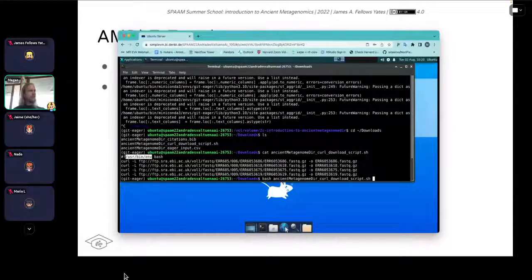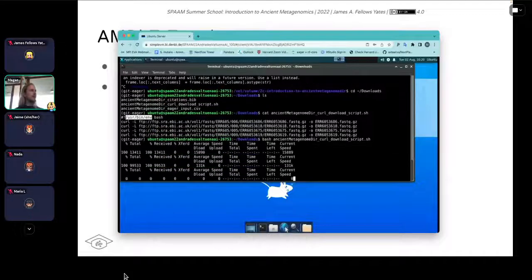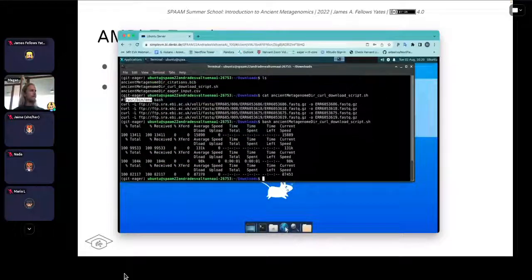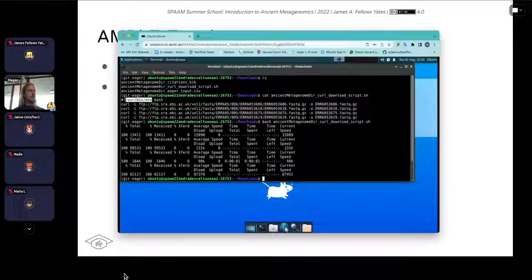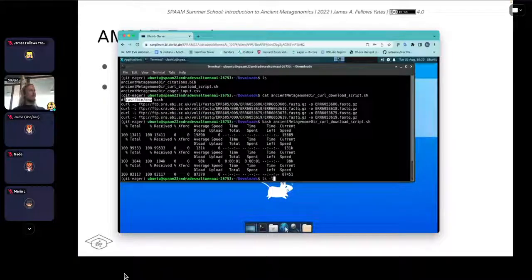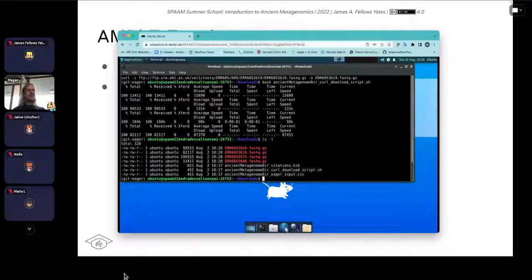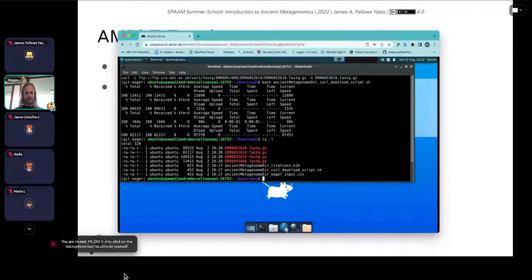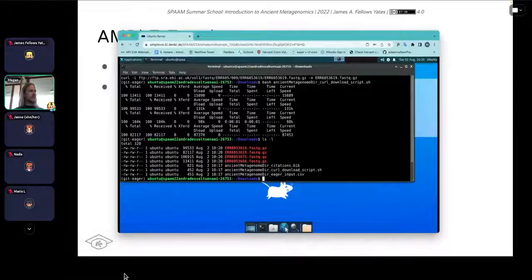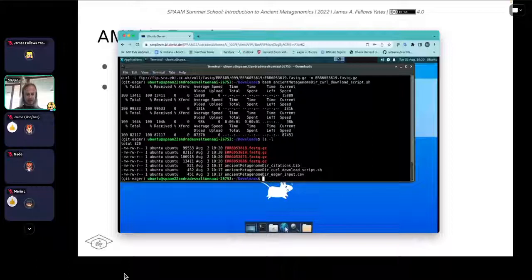You should see your fastq files downloading. Are people getting this? Thumbs up from Maria, Emily — good.